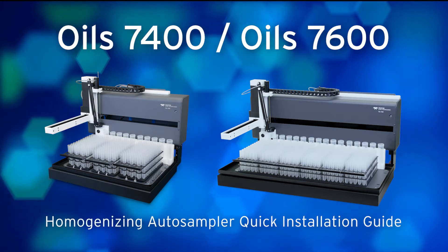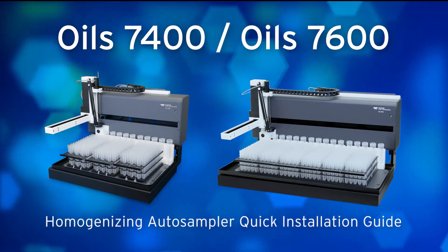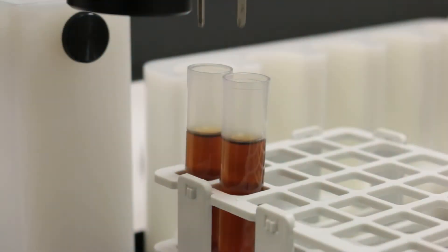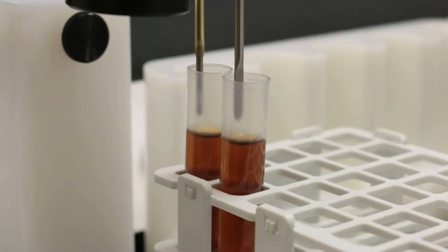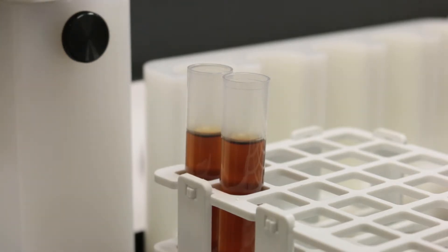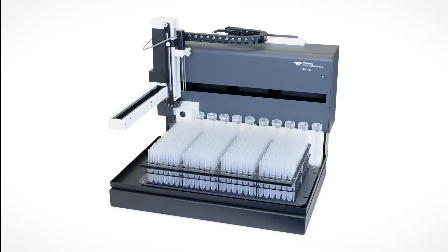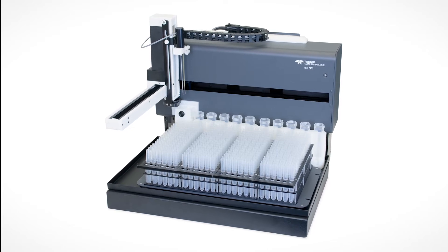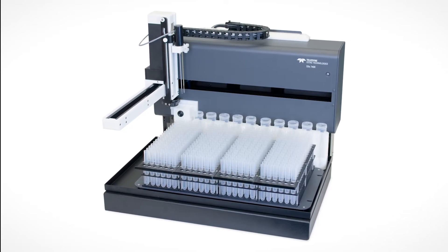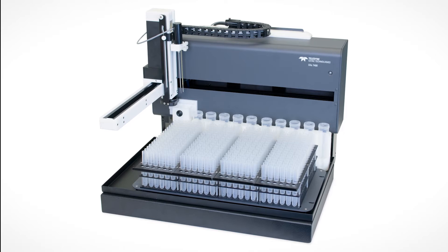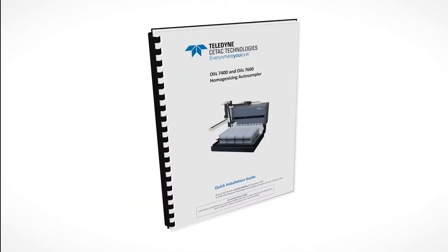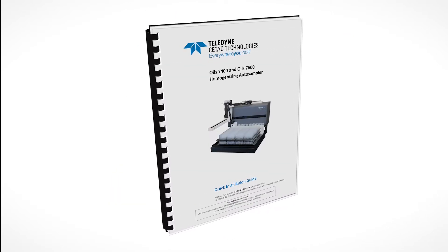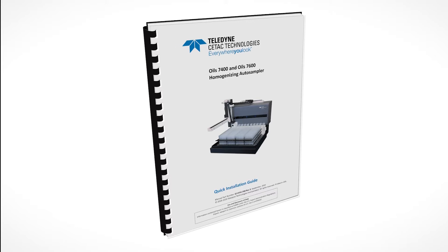OILS 7400 and OILS 7600 Auto Sampler Installation. This video will help you install your OILS 7400 or OILS 7600 Auto Sampler with a simple configuration. Here you can see a typical OILS 7400 Auto Sampler. Your Auto Sampler may have minor differences from what is shown. For additional information, refer to the quick installation guide included with your Auto Sampler.